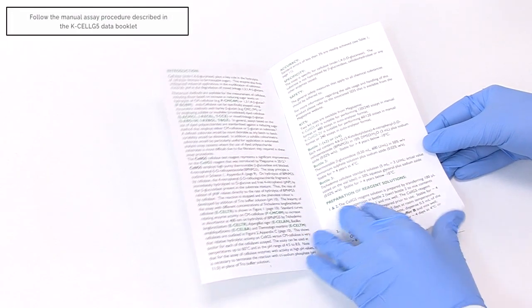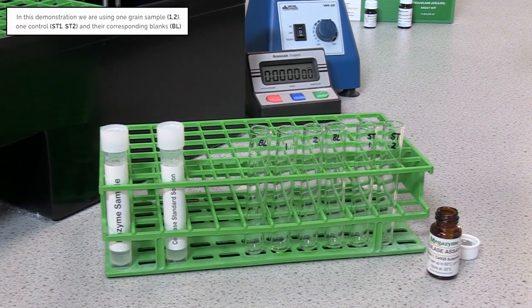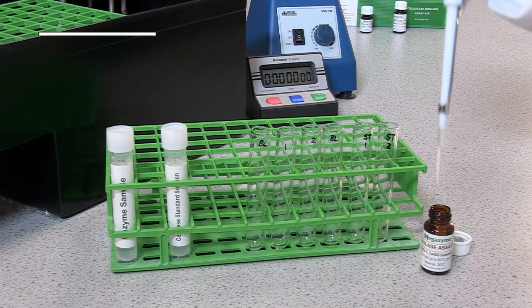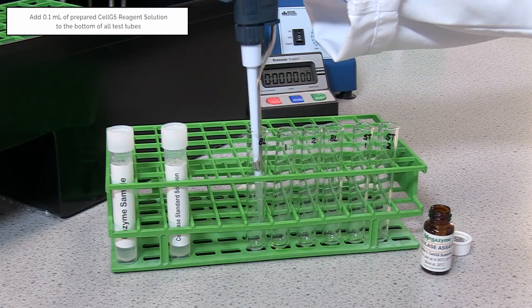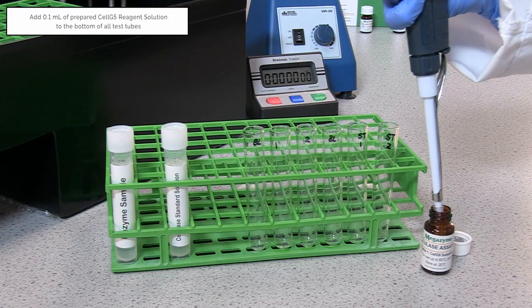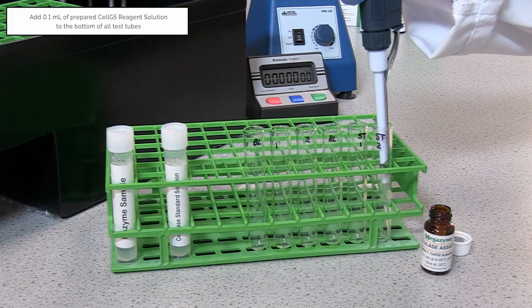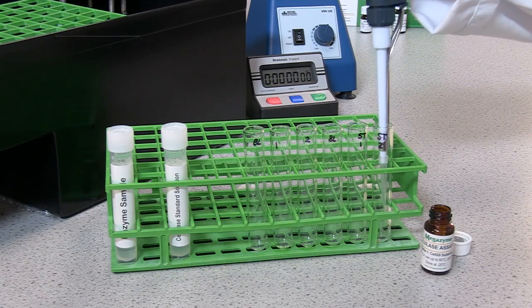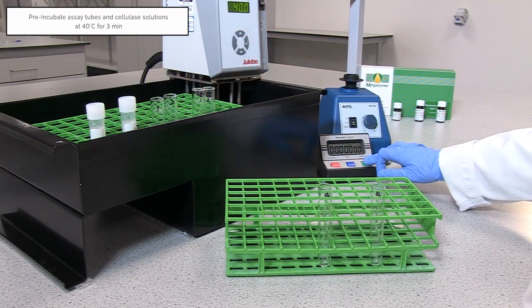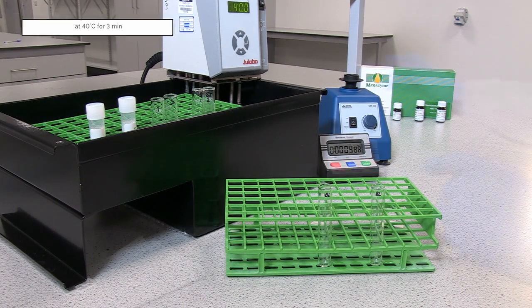Follow the assay procedure on page 5 of the data booklet. In this demonstration, we are using a grain sample, one control and their corresponding blanks. Dispense 0.1 millilitre aliquots of Cell G5 reagent solution directly into the bottom of 13 millilitre glass test tubes. Pre-incubate at 40 degrees Celsius for 3 minutes. Also pre-incubate diluted cellulase solutions at 40 degrees Celsius for 3 minutes.